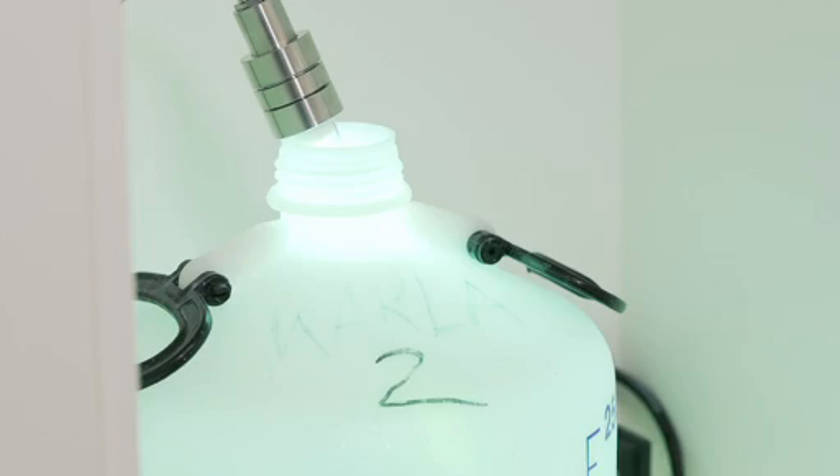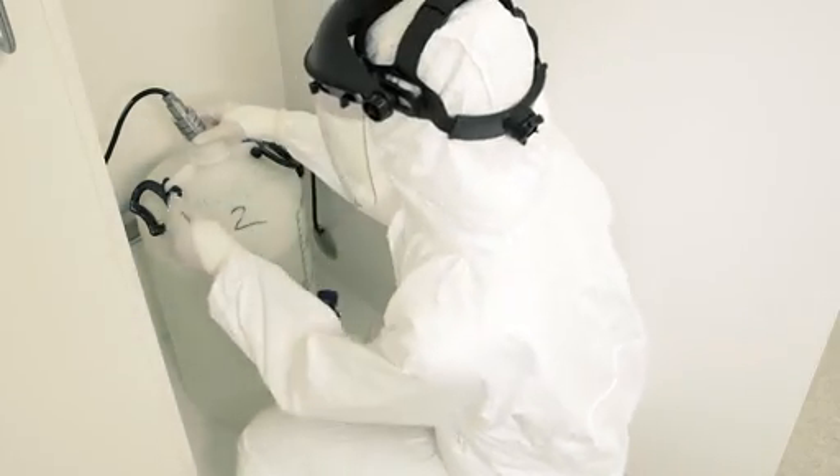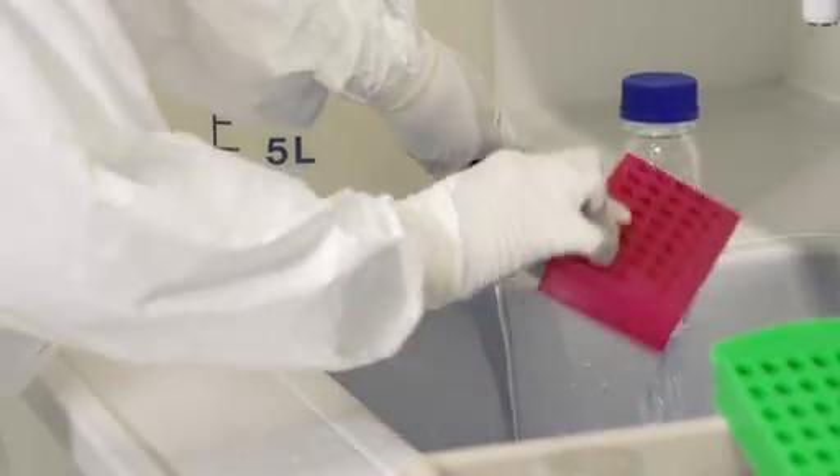Cleaning is the most important part of working in an ancient DNA laboratory. We even have a waterproof UV bulb to irradiate our cleaning water. We have two rooms dedicated to cleaning our utensils, like racks and bottles.